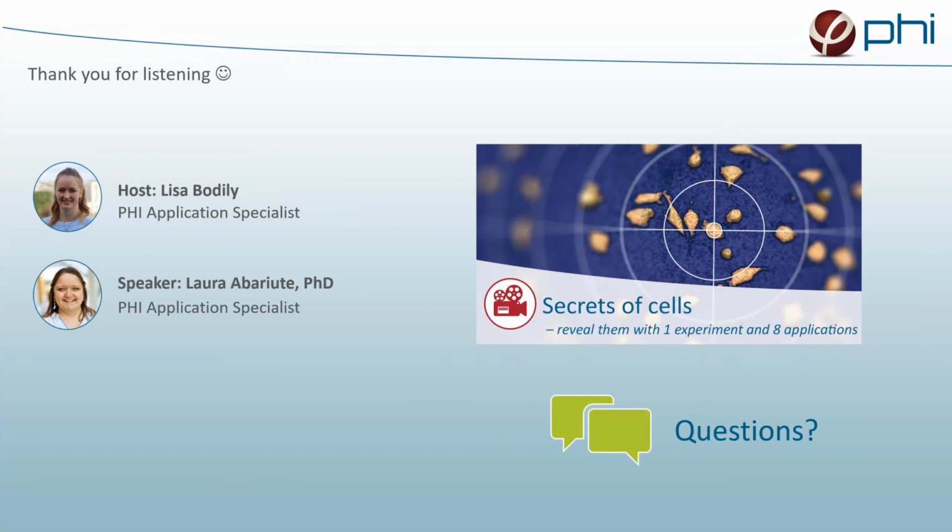Another question comes from Leon from Hong Kong. Leon is asking about the reanalysis part you've been talking about. And his question is, don't you have to redo any part of the experiment or the setup? Thank you for the question, Leon. No, you don't. That's the beauty of HoloMonitor App Suite software, because you get to reanalyze the data anytime you want. You can come back a year later, a week later, 2 days later, whenever you decide, oh, in that experiment, I could have gotten a bit more information, because everything is saved inside the software and inside the images, so you don't lose anything if you don't do the reanalysis straight away.